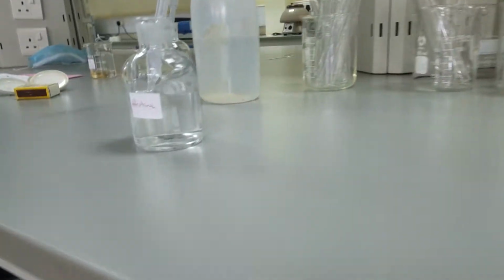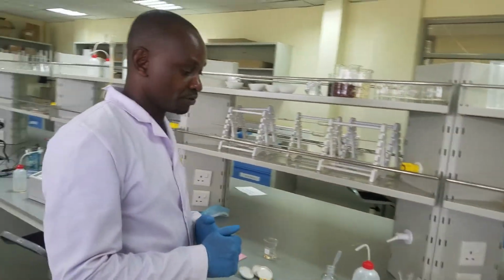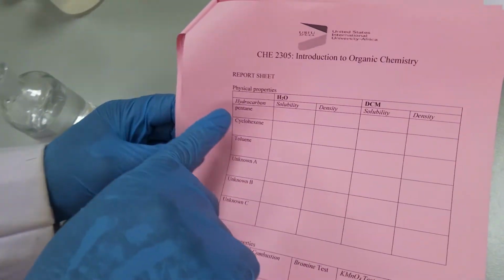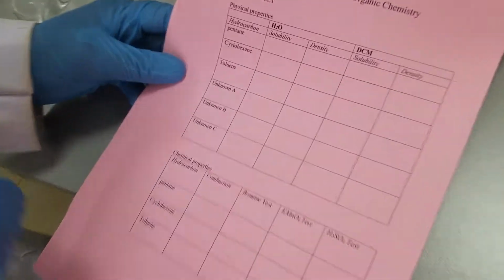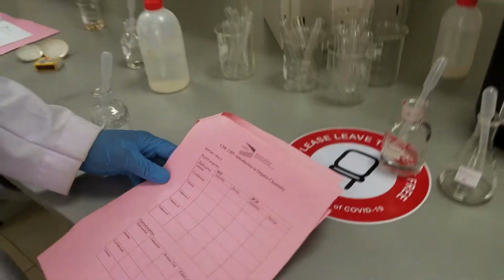So our first one is heptane. I would like you to change from your manual. It is written pentane, but we are not using pentane. We are using heptane. Remember, all of them are alkanes, and they work in the same way. So if you look at your manuals very well, I want you to adjust from pentane to heptane. And we don't have cyclohexene, so you will do this one when you resume face to face.